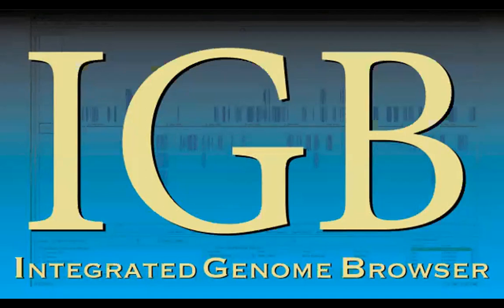Okay, so somebody asked a question about looking at the normalized signal.